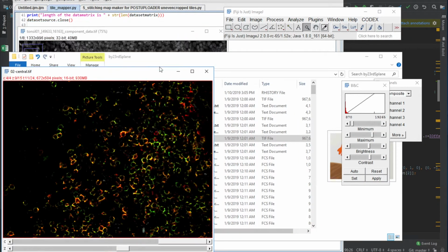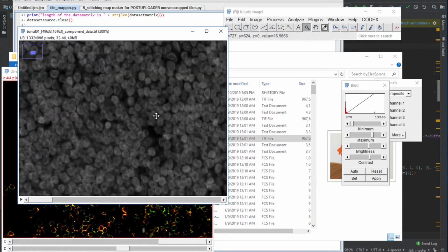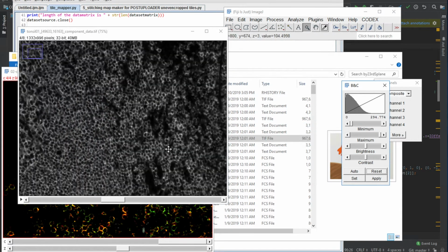First of all, this is your data. It looks really great. I think we can make a killer segmentation out of it. I will try to convert it into the format. So this is your nuclear signal, I suppose, channel 1. And then I suppose that this is your CD45 signal. I think we can get a killer segmentation out of it, and I will show how to do it. But first we'll have to convert it into the format that can be eaten by Codex software.